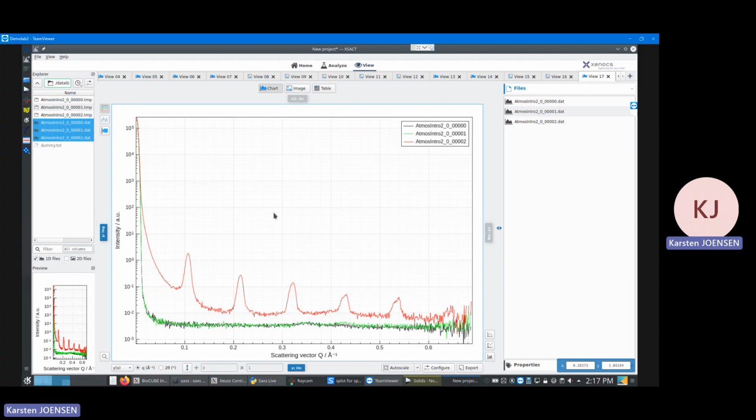So I think with that, that gives you a quick intro to the things that you'll need to be careful of and observe when you're using the atmospheric caps.